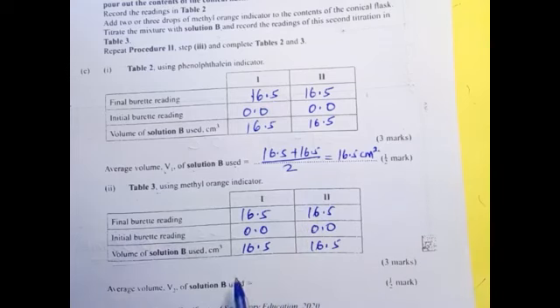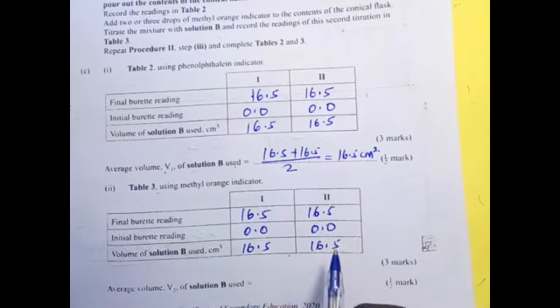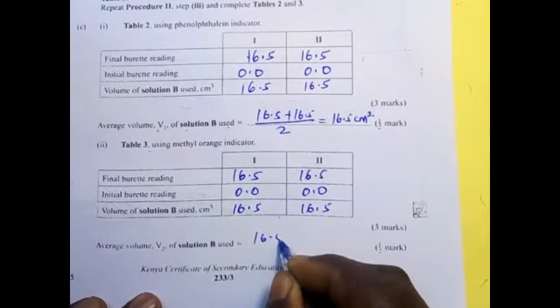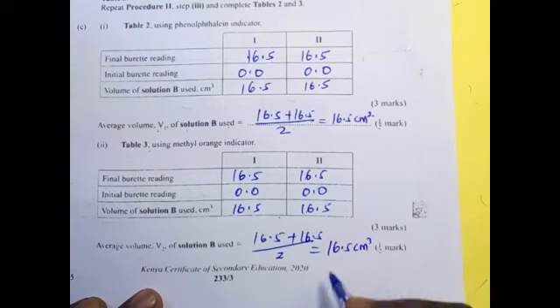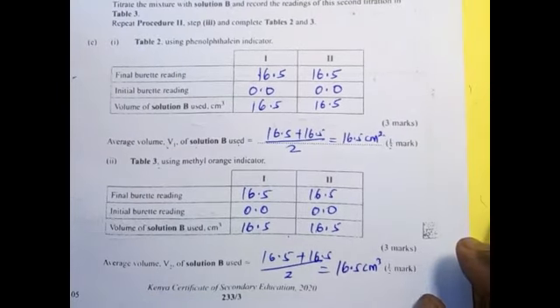I don't recommend that you skip the practical, but the average here doesn't matter much. The thing is, do you know how to use the average you decided to use, correctly, step by step, down the questions? The average here is 16.5 plus 16.5 divided by 2, which is 16.5 cm³. So this is how the table was. Let us go to the next page and see the questions.